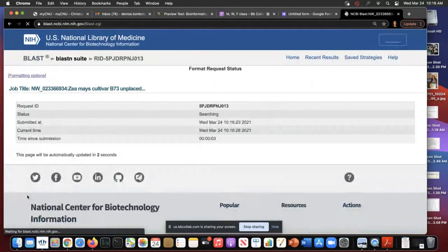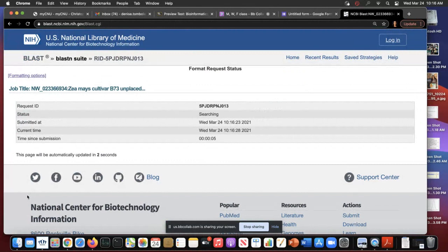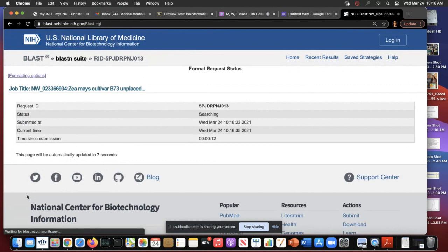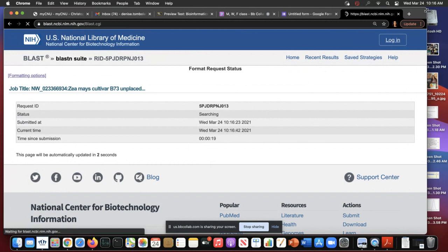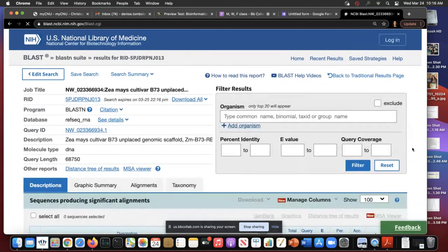All the other options, I just wanted to show you what you would do if you end up working with this. But for the exam, the way I will write the question, this is the one thing you run. For the exam, it will be whatever is fastest. And this is it.